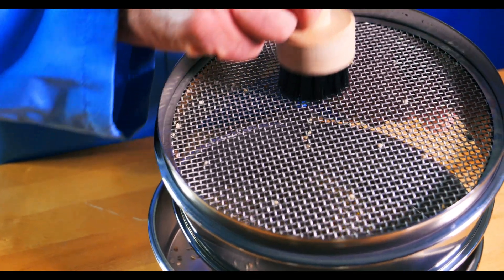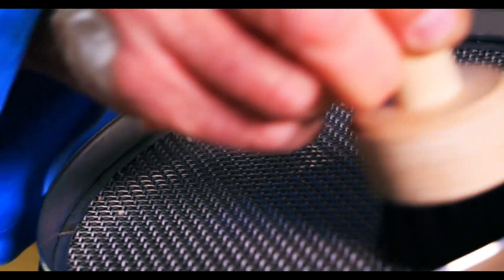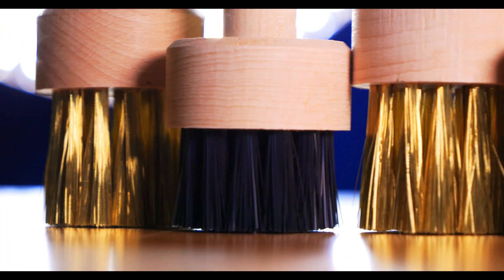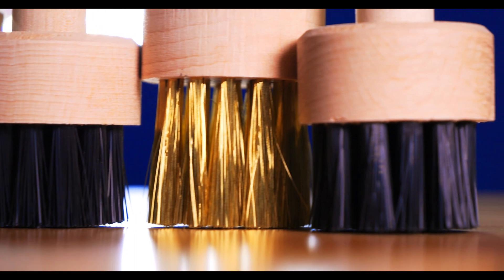Test sieves should be cleaned after each use to ensure the following sample doesn't become contaminated with previously used materials. To clean your sieve, turn it over a receiving pan, gently brush the underside of the mesh using a circular motion, and gently tap the sieve frame with the brush handle to remove any clinging particles. If the sieve needs further cleaning, a mild cleaning solution — whether a mild detergent or a spray — can be used. It's important to use a brush specifically intended for sieve cleaning so it isn't too hard on the wire mesh.